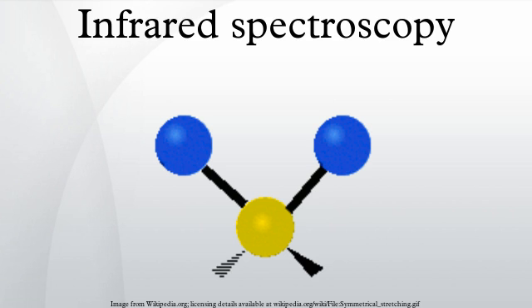Two-dimensional infrared correlation spectroscopy analysis is the application of 2D correlation analysis on infrared spectra. By extending the spectral information of a perturbed sample, spectral analysis is simplified and resolution is enhanced. The 2D synchronous and 2D asynchronous spectra represent a graphical overview of the spectral changes due to a perturbation as well as the relationship between the spectral changes at two different wave numbers. Nonlinear two-dimensional infrared spectroscopy is the infrared version of correlation spectroscopy.